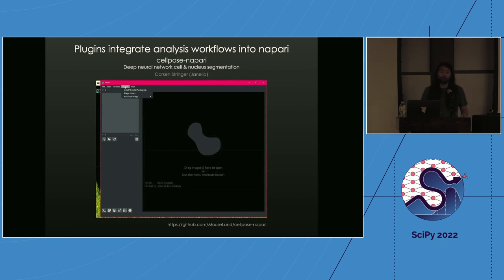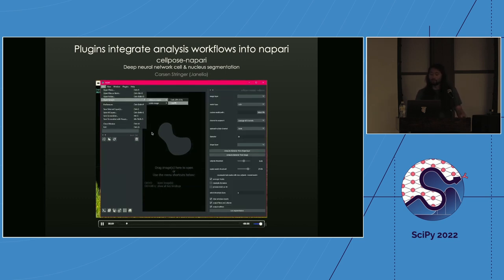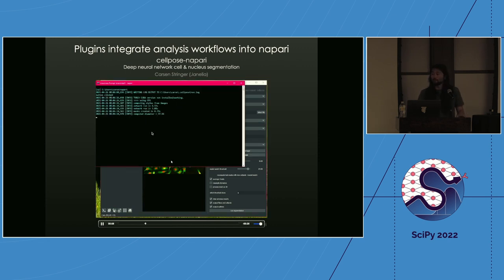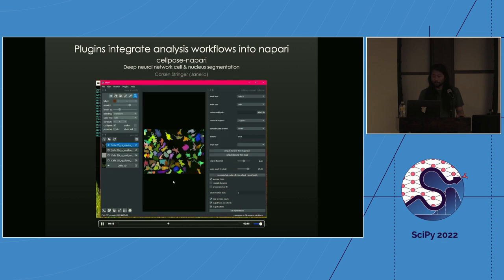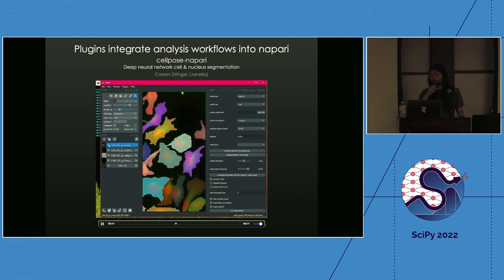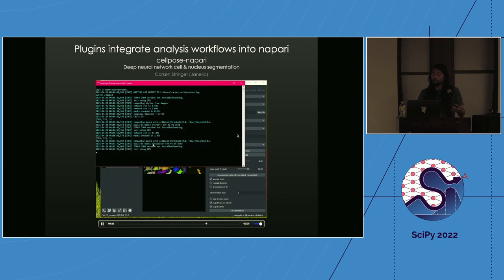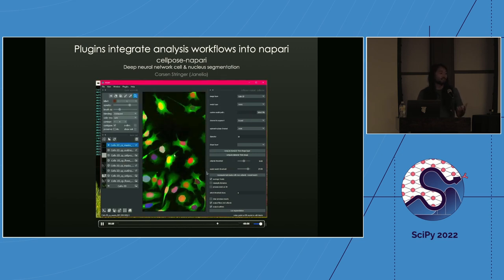Next, we'll go through a few different ways people interact with Napari. One way is loading images and using plugins to do analysis or exploration in the GUI. This is an example of a plugin from Carsen Stringer at Janelia — a segmentation algorithm using a deep learning neural network that identifies individual cells in microscopy images, with a nice user interface to choose settings and models.